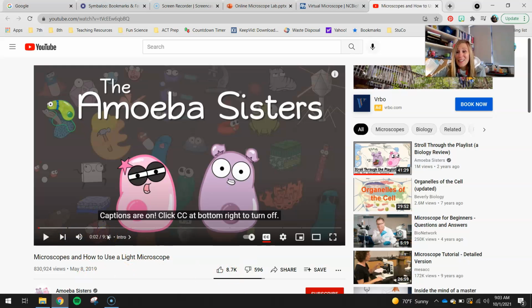It's about 9 minutes long, but it'll basically talk about all the different parts of a microscope, and different types of microscopes. Most of the pictures that we've seen in class are what we call a scanning electron microscope, where we get to see really cool images of the surfaces of cells. If you look back at a lot of the backgrounds from our past assignments, those are all scanning electron microscopes.